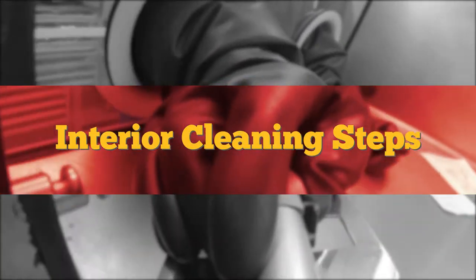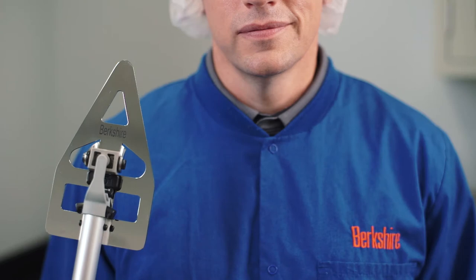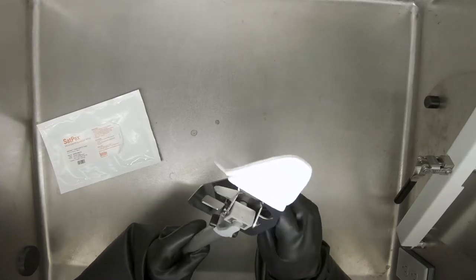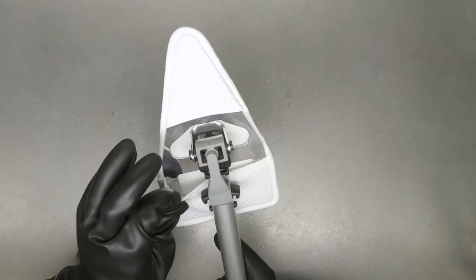Interior cleaning steps. Use the autoclavable EasyClean 360 tool and a sterile padded cover pre-saturated with isopropyl alcohol (IPA) and deionized water.